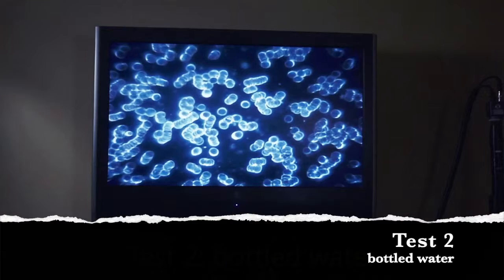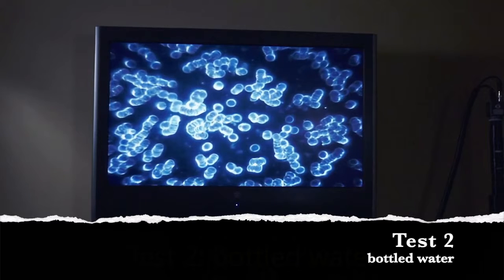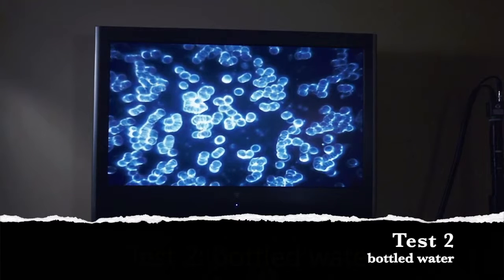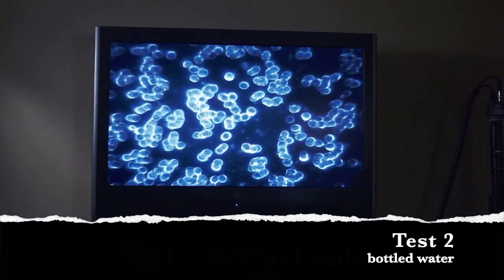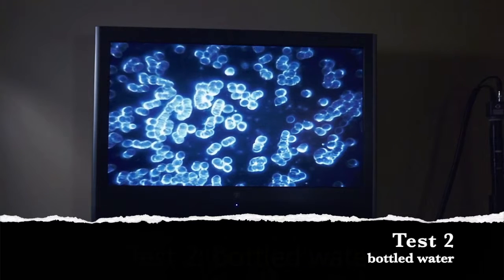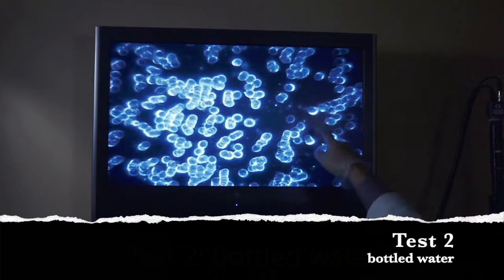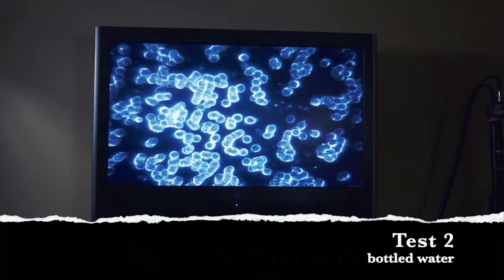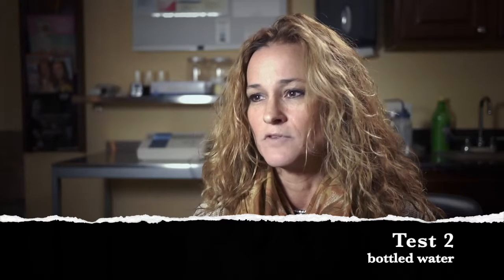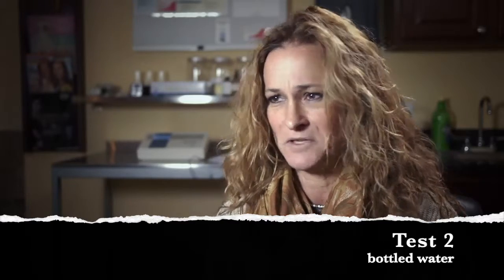Being out of the body, obviously, it's not going to be as happy as in the body. But at the same time, it should have this continuous waterfall type of flow. I mean, over a minute. And then, as time subsides, it should just go into the steady flow, like what you're seeing, for, it can be hours. After drinking bottled water, it did improve the flow a little bit, but then there was clumping of my red blood cells, which was a bit unsettling.